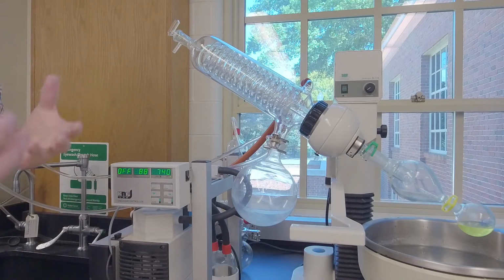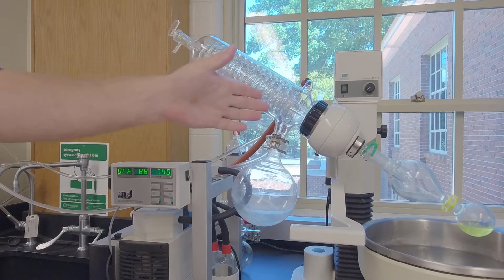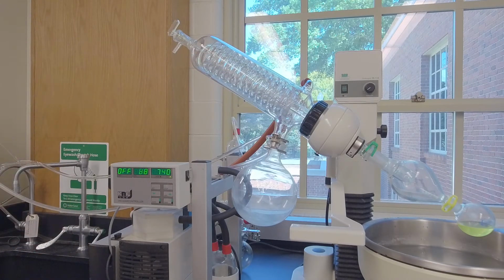Again, this is very important that you have your safety glasses on here because this can, I mean, it hasn't in the history that I've been here, but if there's a crack or something, you could end up imploding the glassware. All right, so we're going to pull this whole thing.